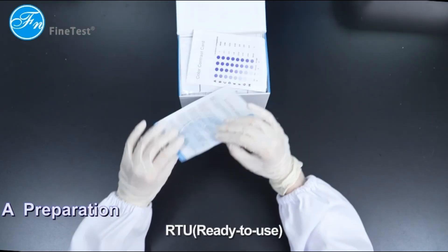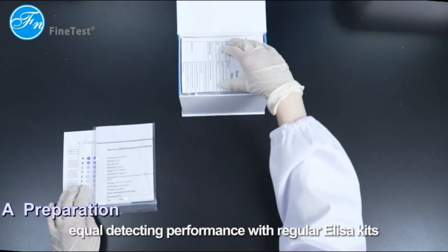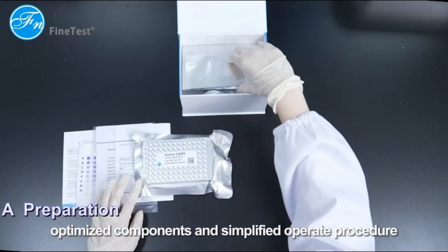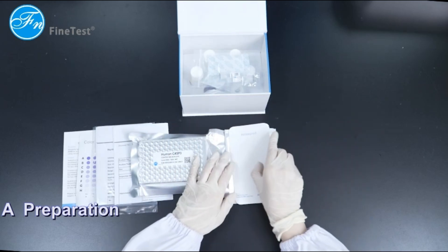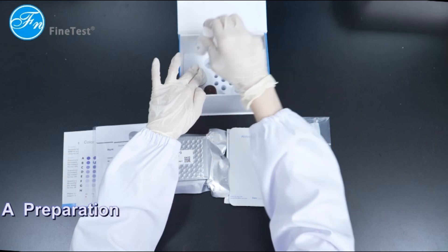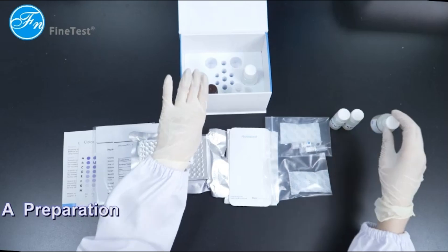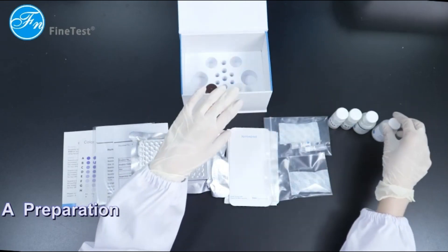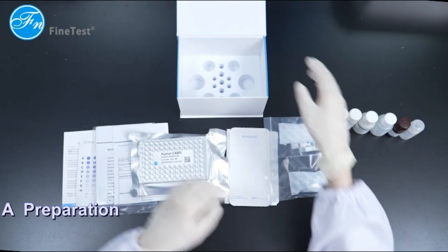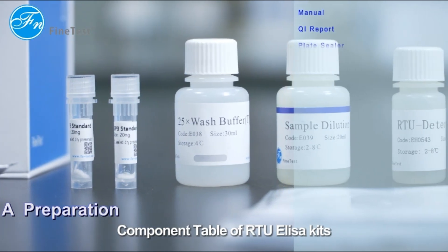RTU ready-to-use ELISA kits offer equal detecting performance with regular ELISA kits but with more optimized components, a simplified operating procedure, and a simplified component table.